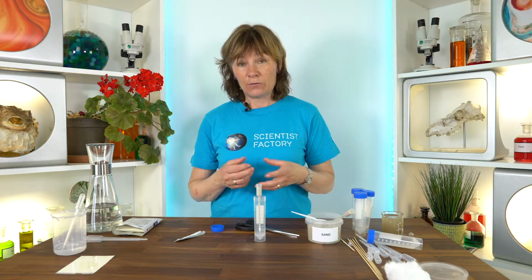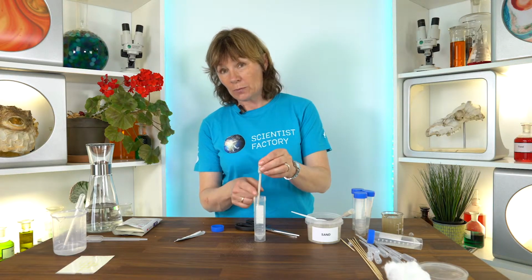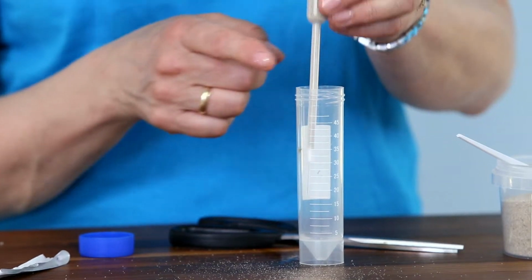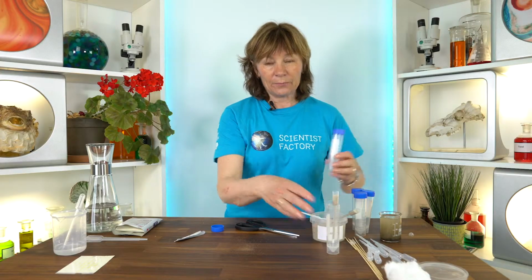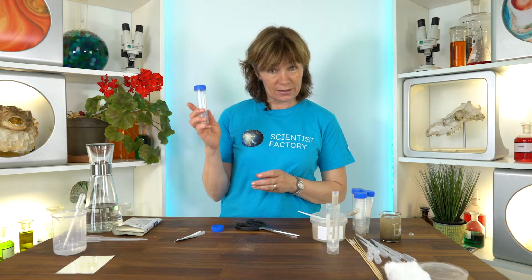For example, maybe they will say, well, I want to take it outdoors and see if ultraviolet light from the sun can kill bacteria. Or maybe they want to test other types of material in here. Another thing that's very often used to kill bacteria and other microorganisms in water is chlorine, because that's what we have, for example, in swimming pools and also in drinking water. So this is also something you can test here.